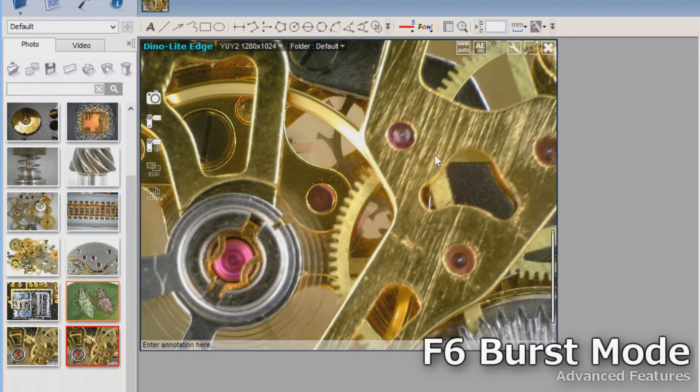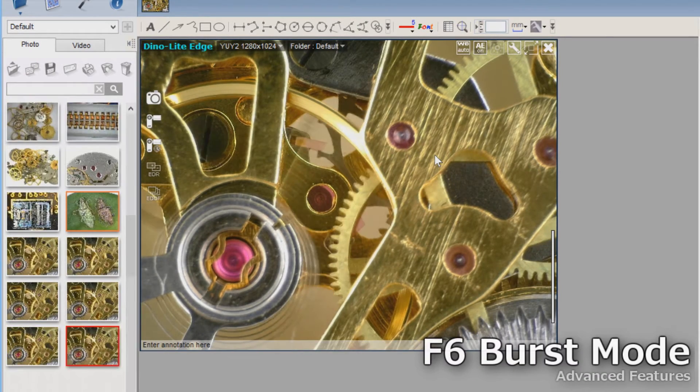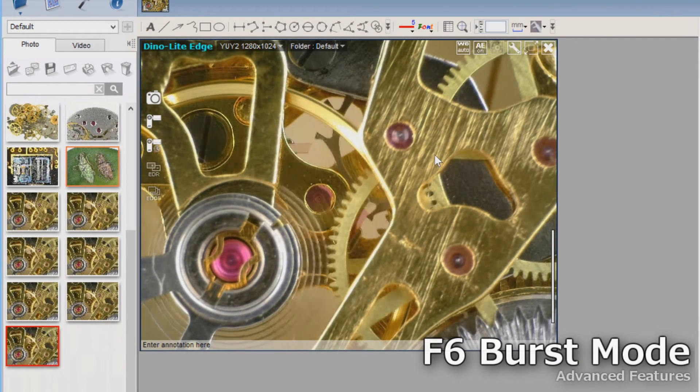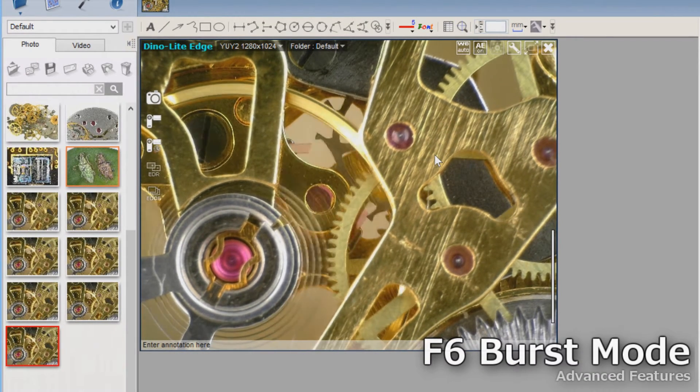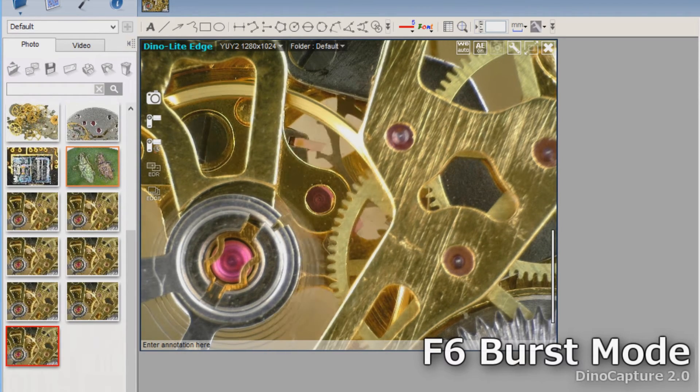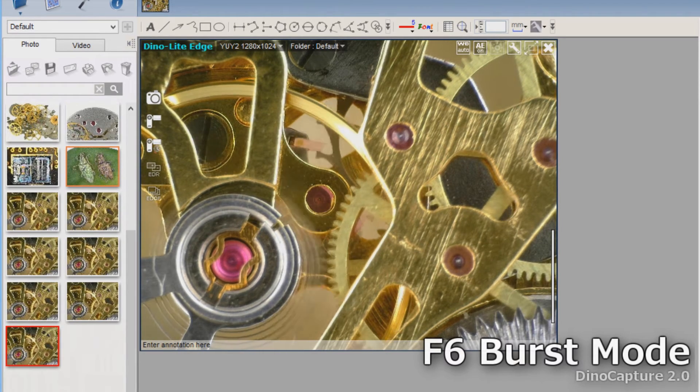To capture multiple images, press and hold the F6 key on your keyboard. This will continue to capture a burst of images until you release the F6 key.